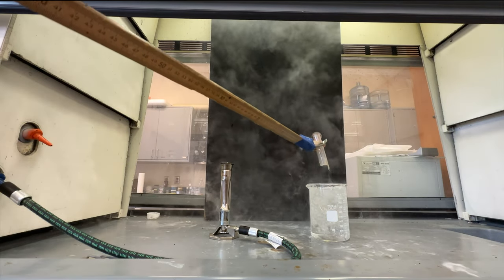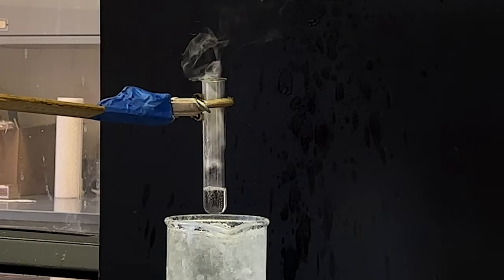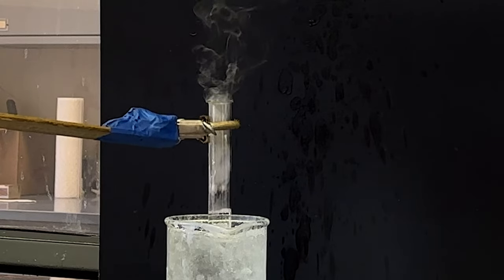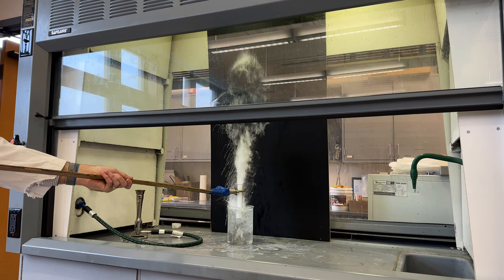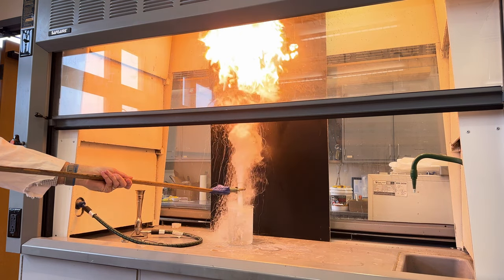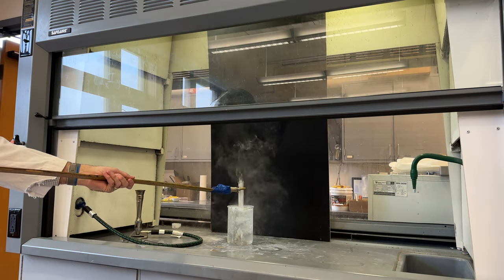So here's the breakdown behind what you just saw. As soon as the test tube hits the ice water, it cracks, allowing water to come in contact with the hot wax and instantly boil, ejecting the boiling wax upwards. This causes the wax to vaporize, mixing with oxygen in the air and igniting at the spot where there's the most ideal mixture of heat, wax, and oxygen at the top of the vapor cloud.